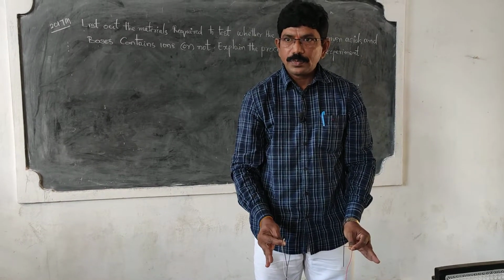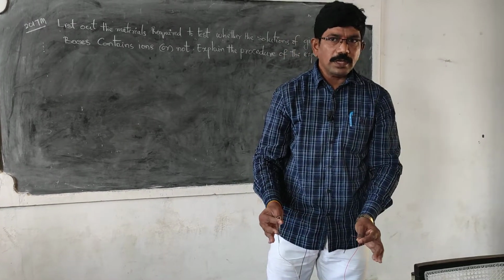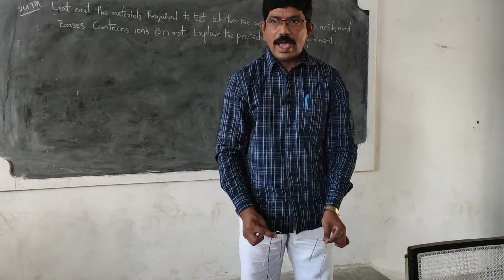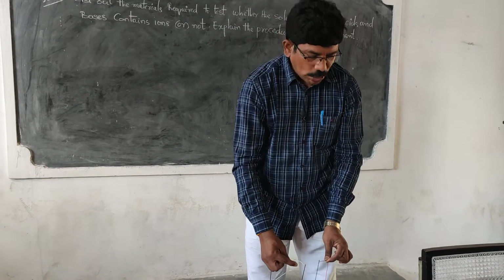Are you clear? Are you following in Telugu medium? Do you understand my language? Are you clear? So, try to understand. Because of the presence of the ions, current passes through the solution.